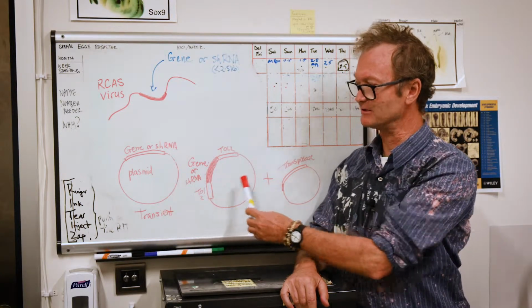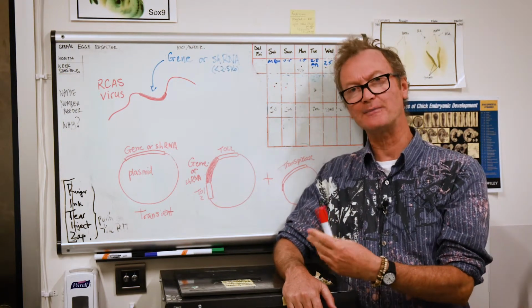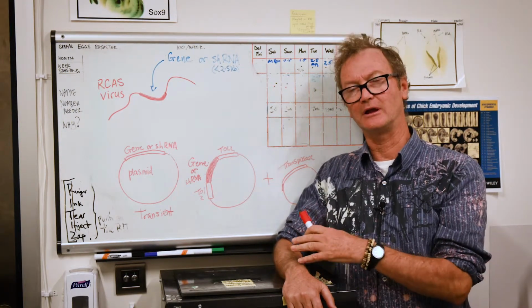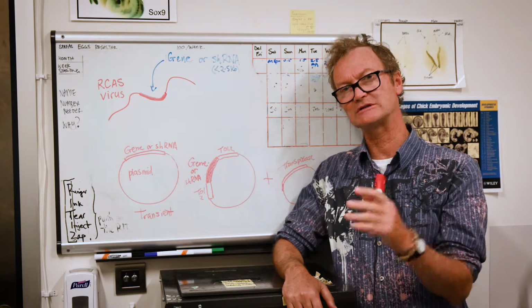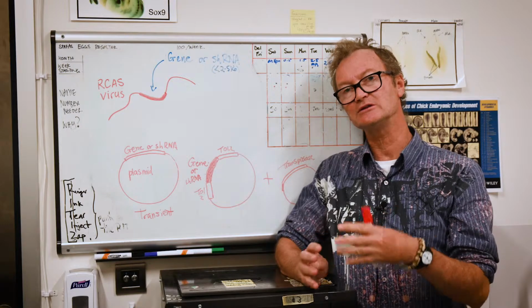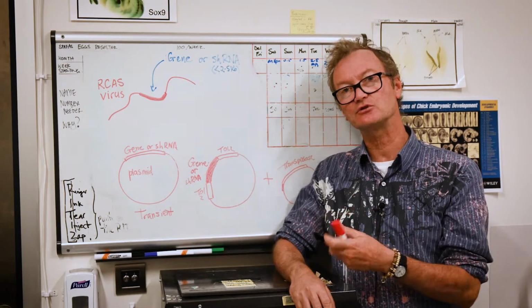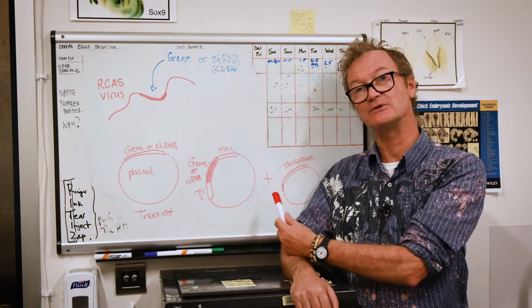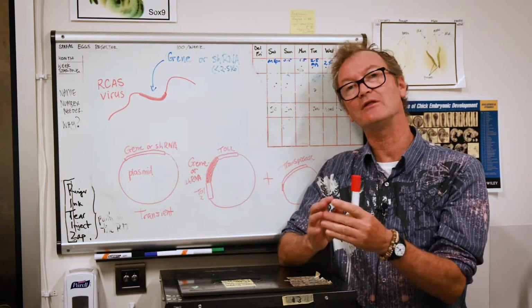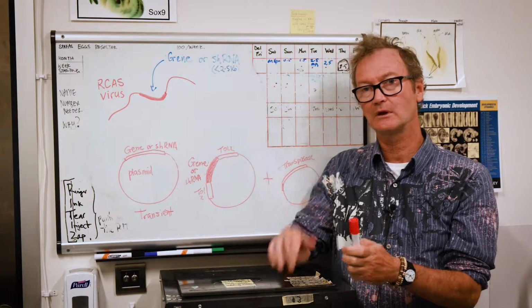Firstly, with these plasmids, with electroporation, you can only really target epithelial cells. Electroporation can't penetrate across a basement membrane, so it's really good for targeting genes or knockdown constructs into epithelia. It's very difficult to actually target things like these plasmids into mesenchyme, so you're rather limited in the types of cells that you can hit or you can target.